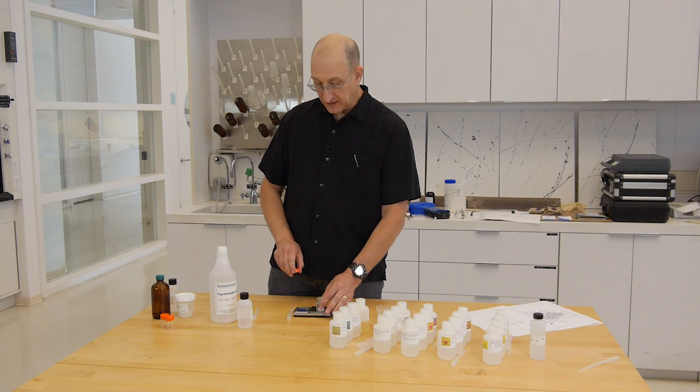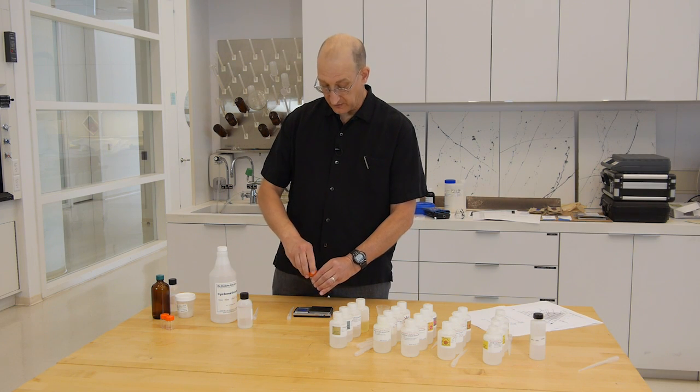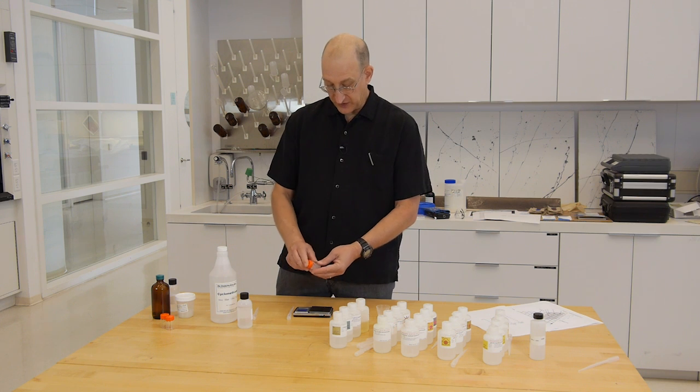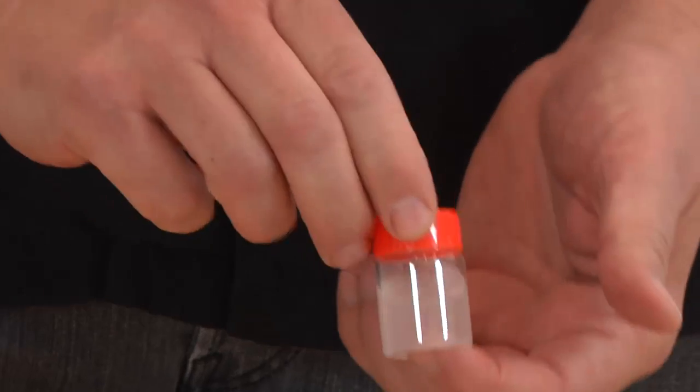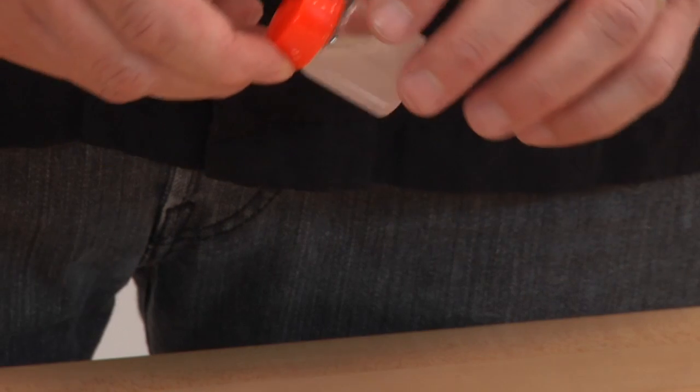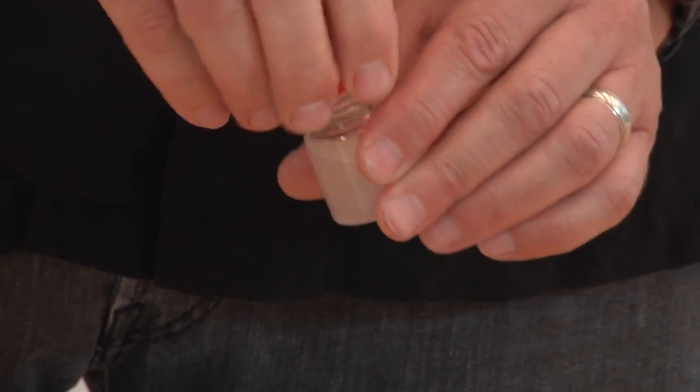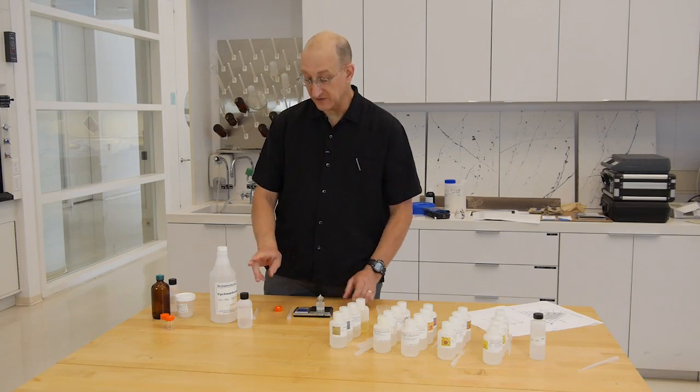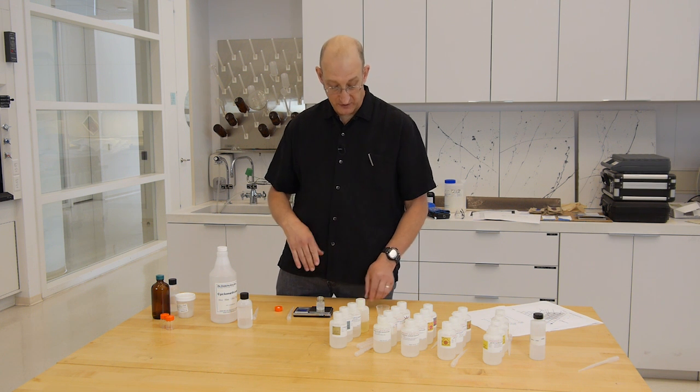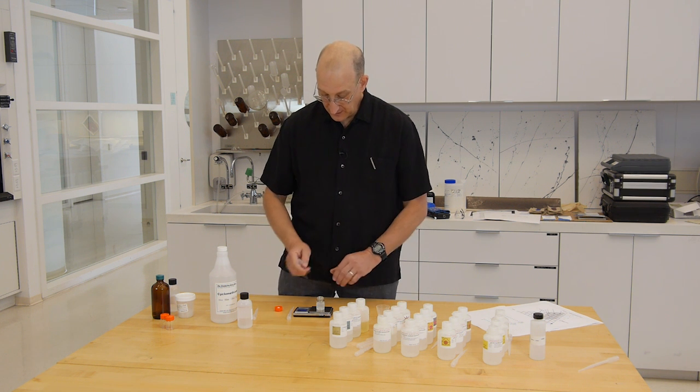You'll notice that the ECOSURF is soluble in the cyclomethicone. So just shaking them up, we should have a clear solution. This demonstrates the fact that we can clear this material with the cyclomethicone, that the surfactant will dissolve in the cyclomethicone on clearing on the surface of the painting.